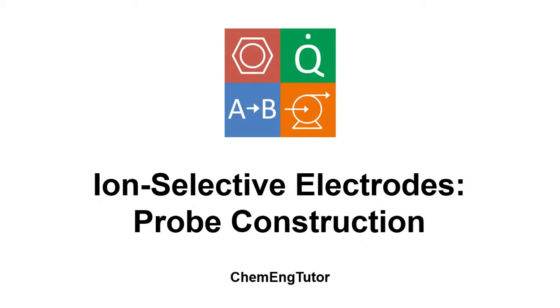In this video we're going to take a look at what goes into making an ion-selective electrode. So we're going to take a look at the basic construction of an ion-selective electrode probe.